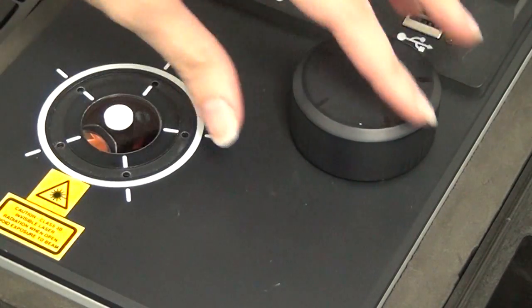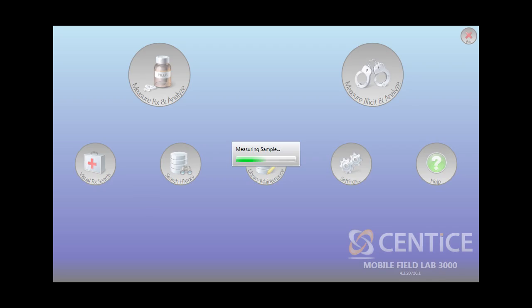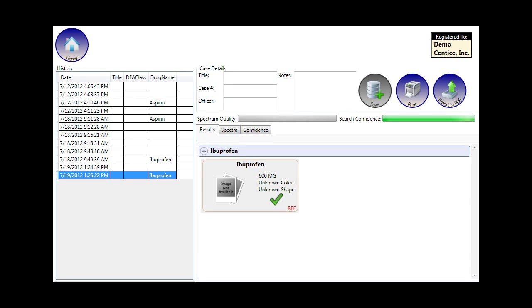Place the sample onto the screen, cover it up, the software initiates the laser, and chemically identifies returning an answer onto the screen.